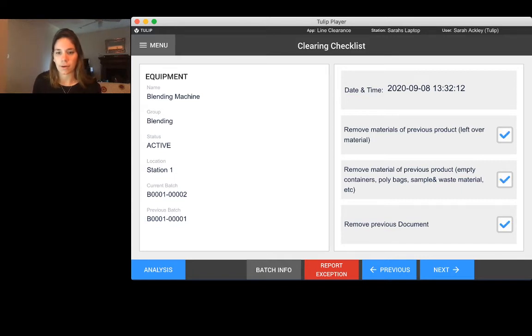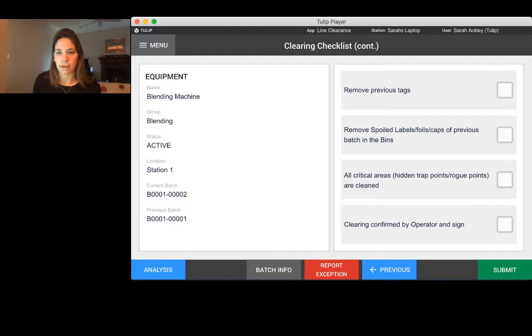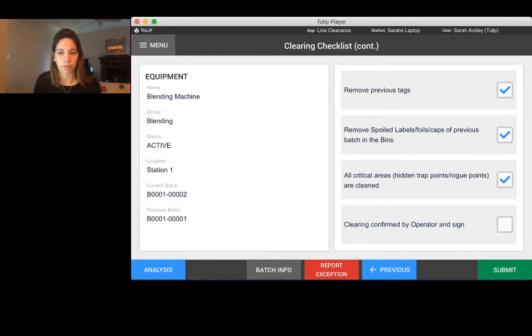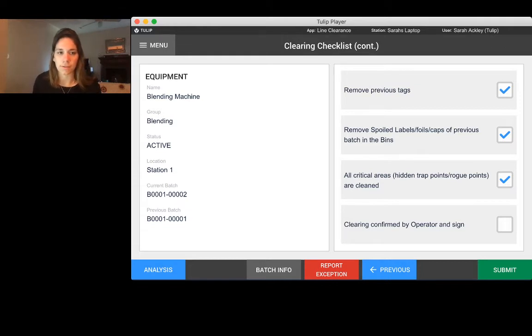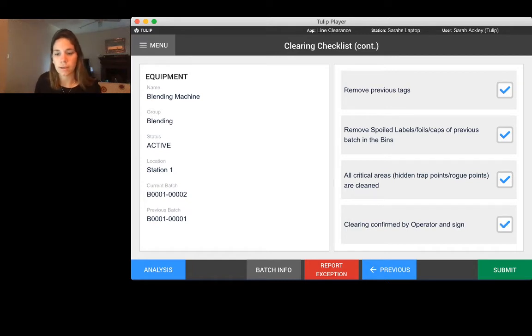I then can go ahead and go through my checklist. You can easily customize this checklist to fit whatever your regulations are. This is just used as an example of how you could use TULIP in order to perform a line clearance.